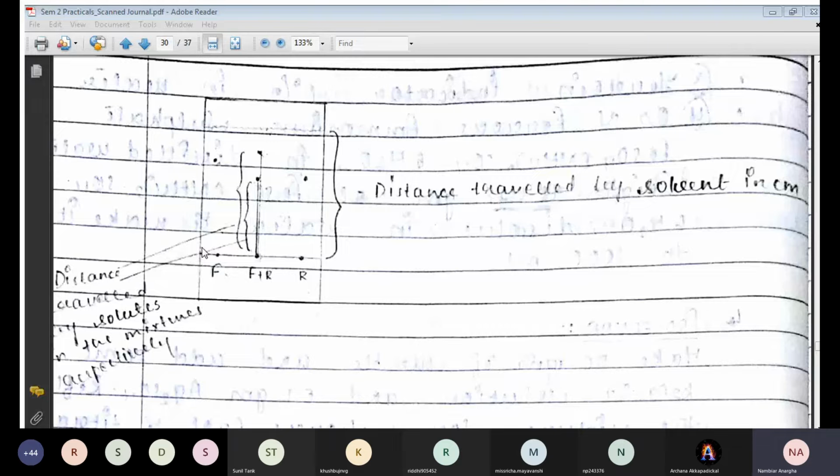Suppose it takes about 20 minutes to complete the run. To complete the run माने the line that we have drawn above, if the solvent system reaches that line, that means we have completed our run. Okay, so once the solvent system reaches there, we have to take out our TLC plate from the solvent chamber.